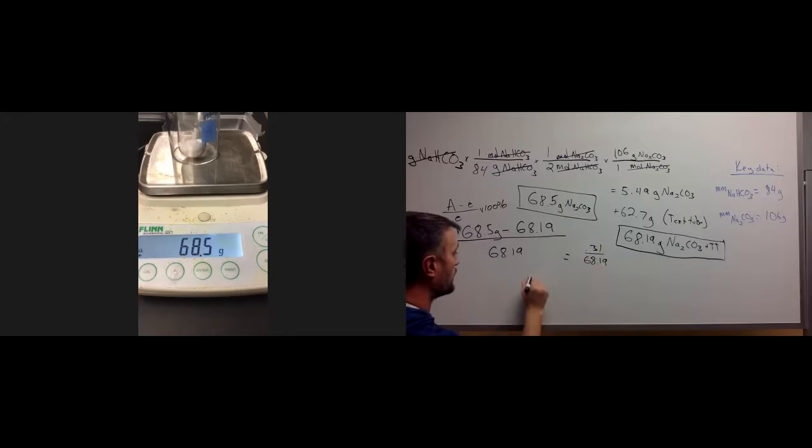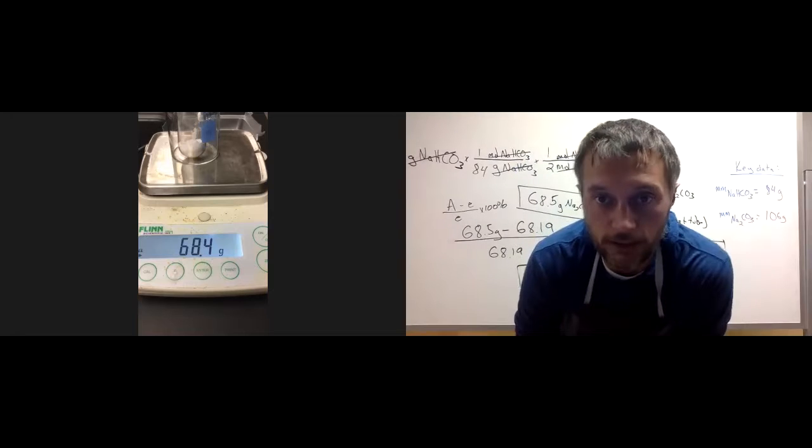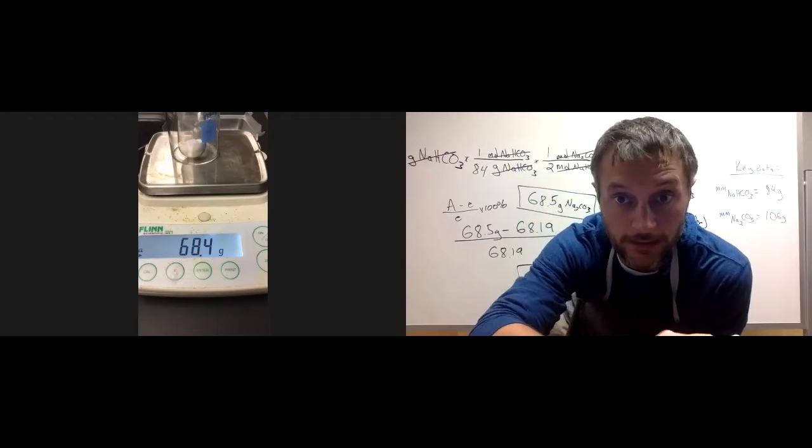So I have a 0.45% error. So that means that Mr. Hyatt did his math well and was able to do the reaction close enough for us to say, yeah, we're 99.5% confident that this is correct. So I'm really sure that I did my math right, and I'm pretty confident that I did the procedure properly. I was able to complete the reaction. So that's a basic stoich reaction and calculation to match it. We'll do a lot more like that in semester 2.